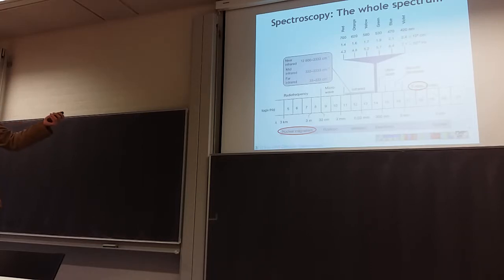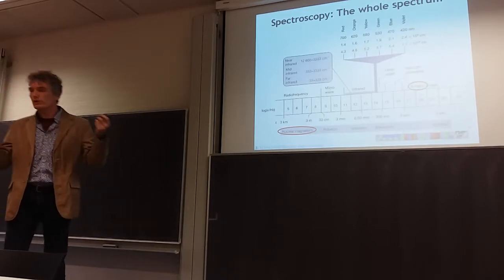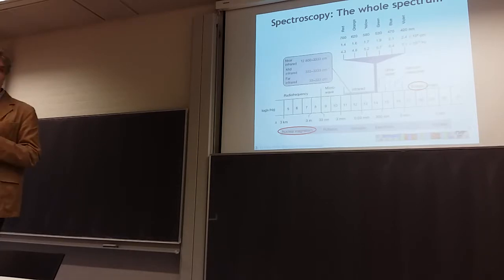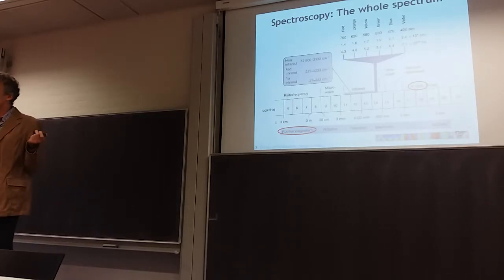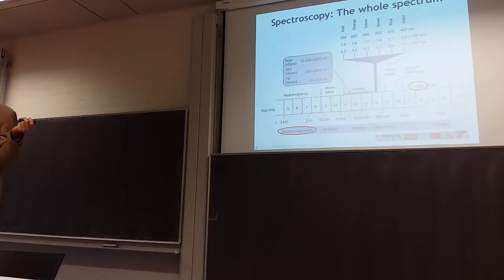Getting information about protein structures in an experiment is not easy, so you need all sorts of cool tricks. Fortunately we have electromagnetic waves, and proteins respond in interesting ways to lots of different wavelengths in that spectrum. The important ones are highlighted.